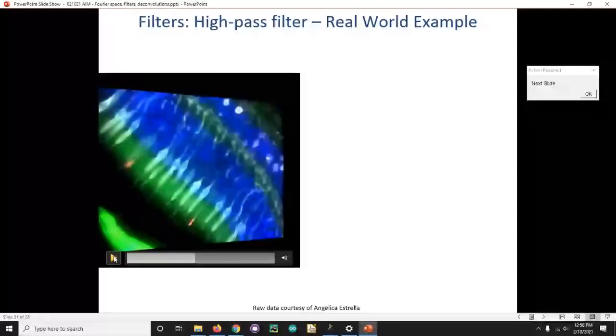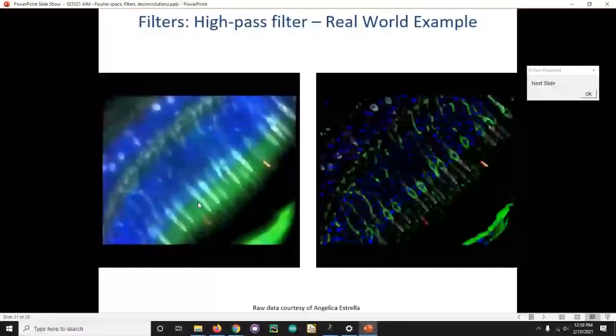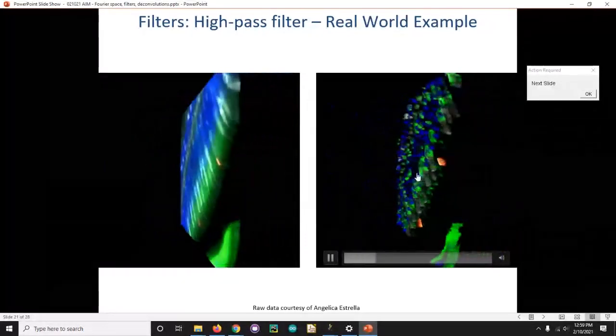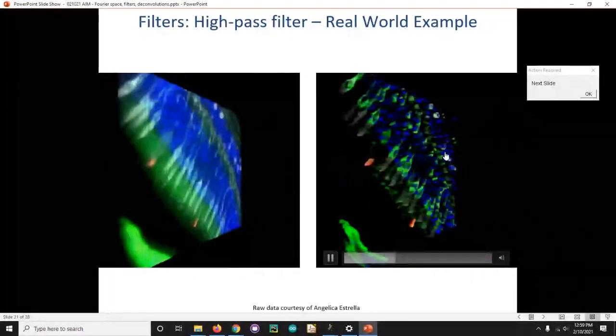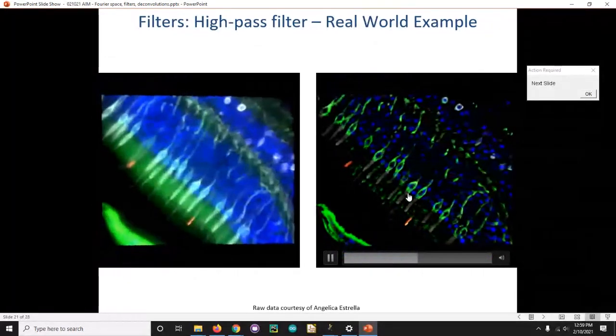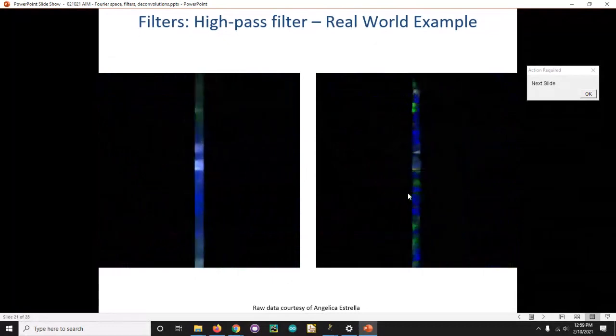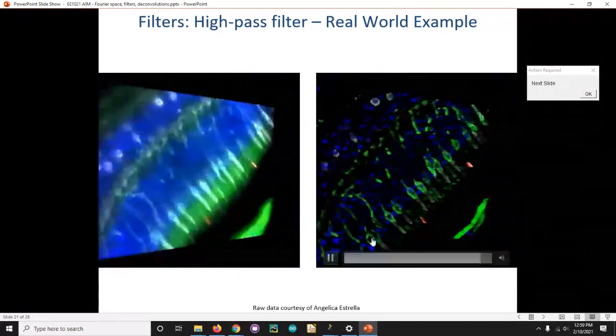So all we had to do is take this image, this movie, and do the blur, right? Because effectively the out-of-focus background is just low frequency information, and therefore what we want to preserve is high frequency information. So we can do the exact same trick. We can just remove the blurred equivalent of this, and the end result is a three-dimensional image. So basically a fully in-focus image with no elaborate or iterative deconvolutions, simply by using the Gaussian blur and subtracting the blurred image from the original.